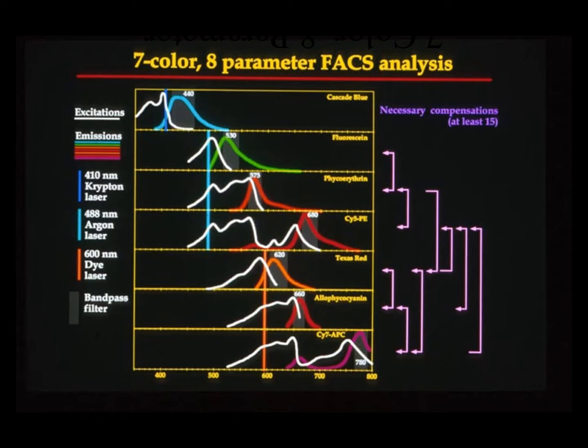But you see we've got compensation on here, the very necessary compensation, leading to what we need to do now, which is to develop FlowJo, which Mario Roederer had a lot to do with, Wayne Moore, of course, in the original algorithms, and the code was actually written by Adam Treister, and he set up the company called TreeStar, and you can actually buy it from the website which he has for TreeStar.